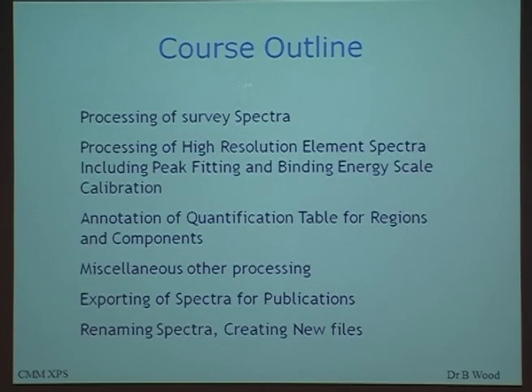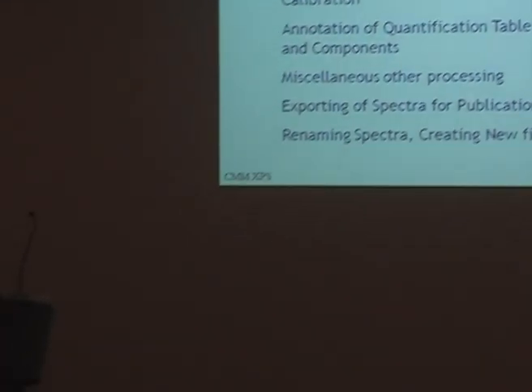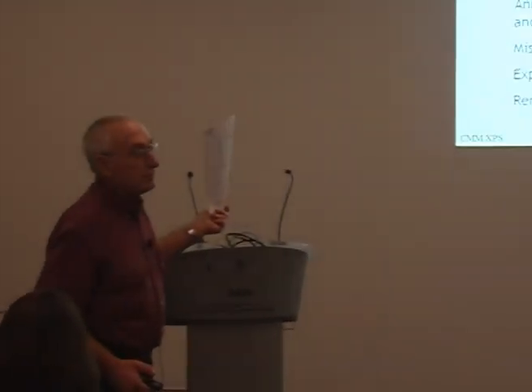Now what we'll be doing is processing survey spectrums, processing high resolution spectrums, and doing some quantification, and we can do these later. These are things that you can easily work out how to do. I'll show you the icons to do it. What we will end up with is a sheet like this. This is a fully processed PCL. We're going to do that.